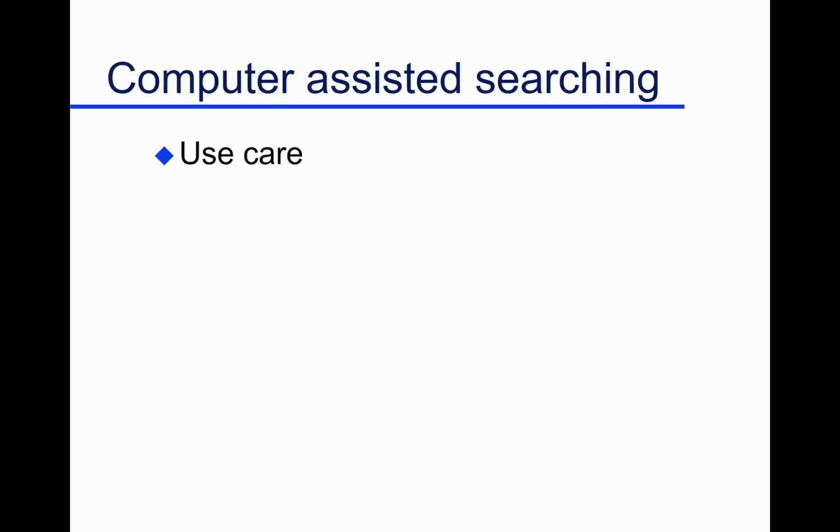again. And I'm thinking, that can't be right. That can't be right. There's something wrong here. He wasn't bothered by it. He just went through this one first, and I raised my hand and said, did you list these compounds in the order that they elute from a gas chromatograph? Because that's what feeds the mass spectrometer. One comes out of the gas chromatograph, goes in the mass spectrometer. And so they have to come out and be listed, typically, in the order they elute.